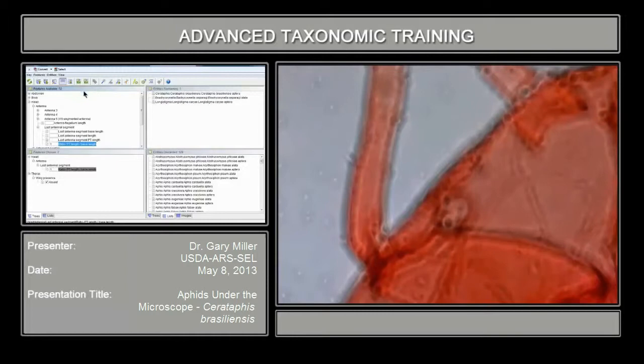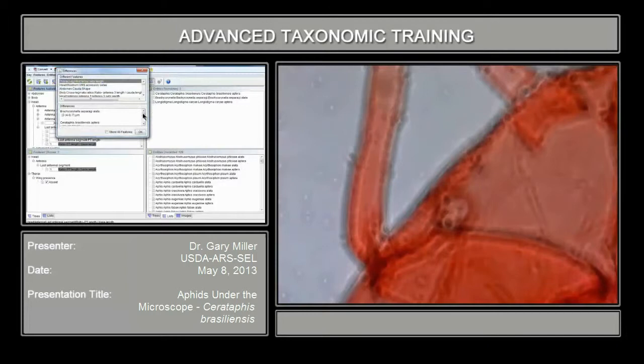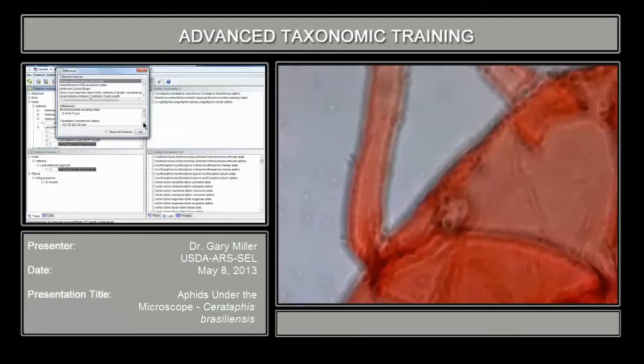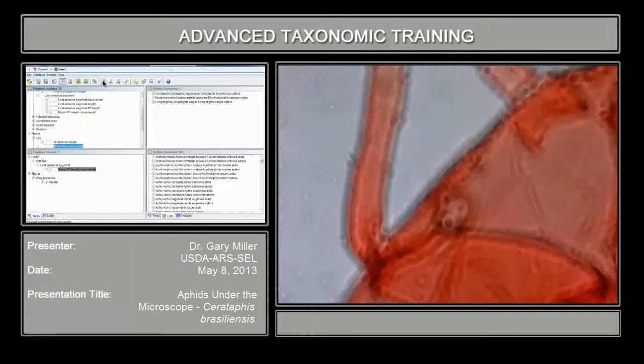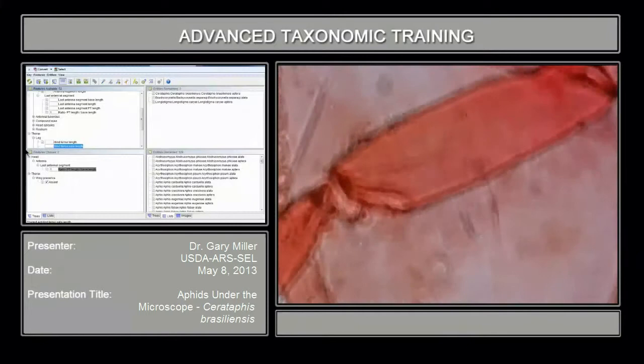We're down to three taxa, three species. This is a case where you may want to look at the differences between them. For some reason, the alata came up as one of them, and we know it's certainly not an alate. But we can look at the differences regarding the hind femur seta length — you can see the ranges listed there.